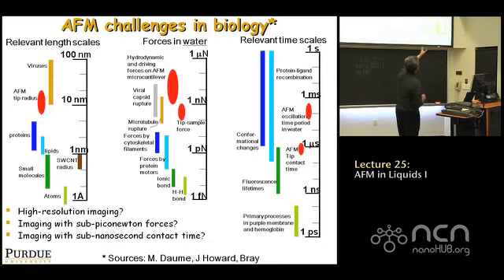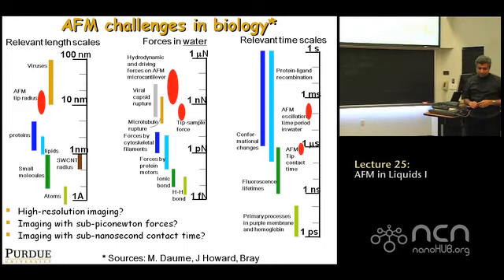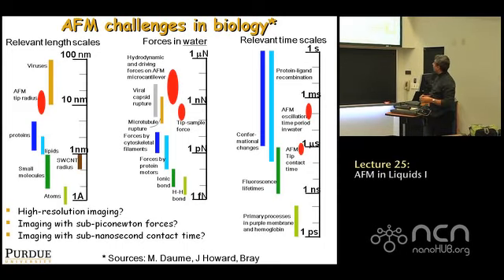Another important scale here is time scale. Just to give you an idea of some of the important time scales you might be interested in observing in biology, because it's a good question to ask: when you're taking an image, can you actually observe at the speed at which you image? Can you observe dynamic processes in biology?